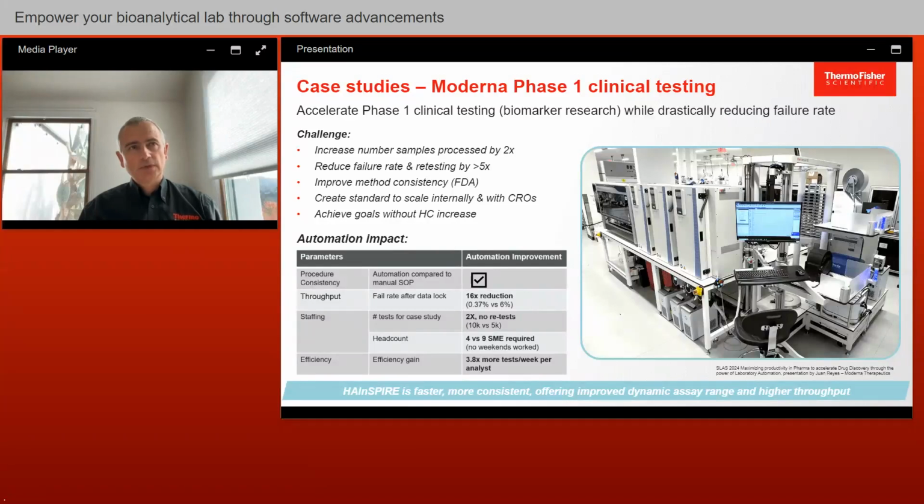But they also wanted really to think about this approach of whether you can, as I say, shampoo, rinse and repeat. It's very difficult to set up a new lab which will do the same testing and then do the tech transfer to it, and then carry out the testing consistently. Doing that with humans in the equation is a difficult task, and it's something that we do all the time, but it's difficult and expensive.